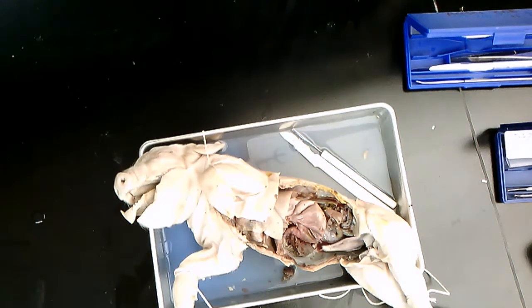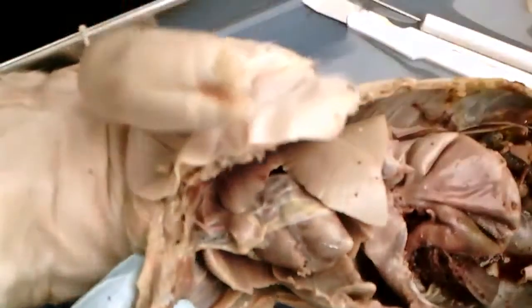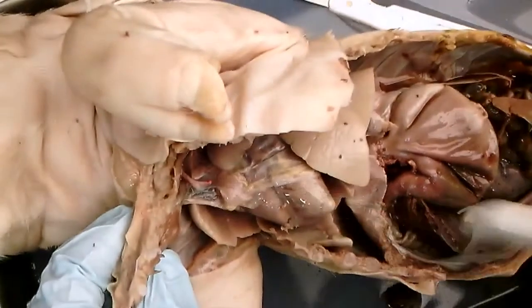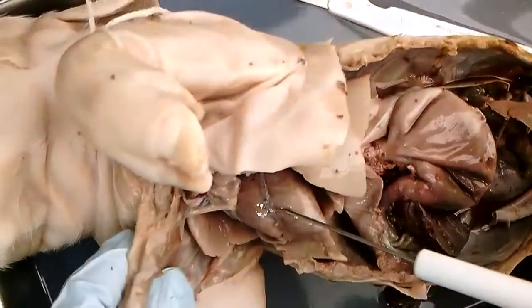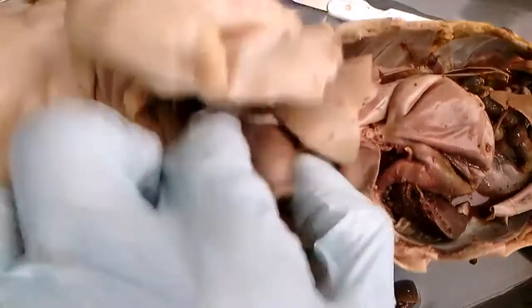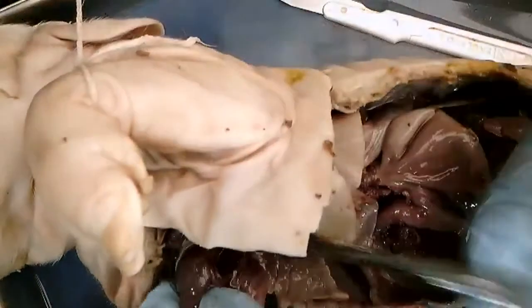Could you zoom in or show the heart and lungs again? Yeah. I'm going to move this down closer, we'll show them, then I'll cut them out. So the heart is right here. And then the lungs are all around it. So you could have your students take their scissors and carefully remove the heart.